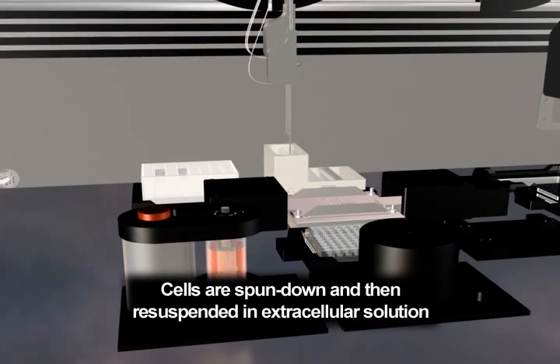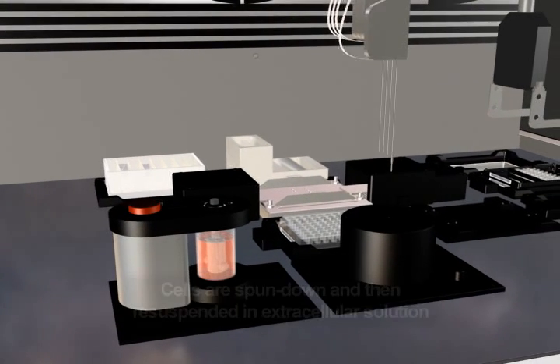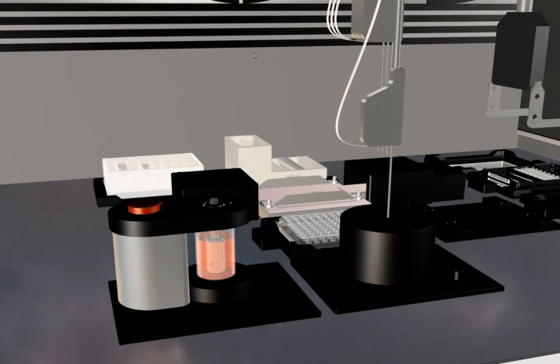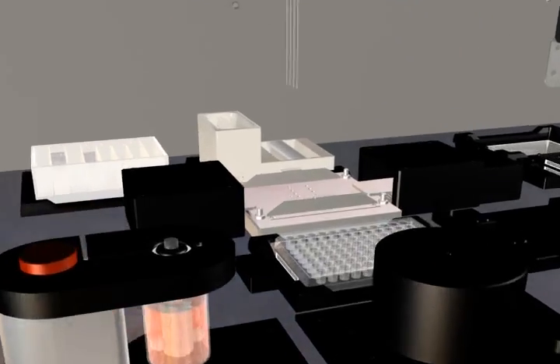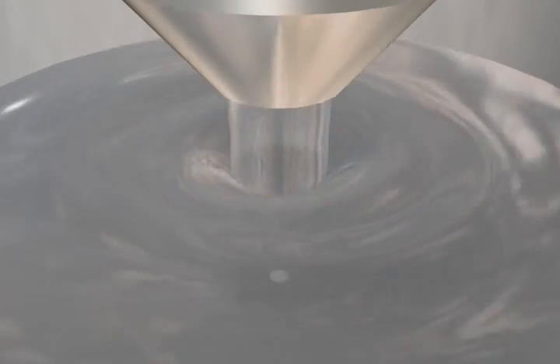An aliquot of cell solution is pipetted into the onboard centrifuge and the cells are spun down. The cells are then re-suspended in extracellular solution before addition to each of the 16 channels on the Q-Plate.